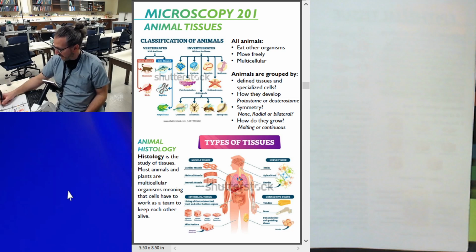Like I can have this gigantic megakaryocyte. They don't hyphenate it. I'm doing this for you. That means big nucleus, or nut, is actually what it means, cell. So we read things backwards. It's a cell with a nut that's big. Megakaryocyte. Right?